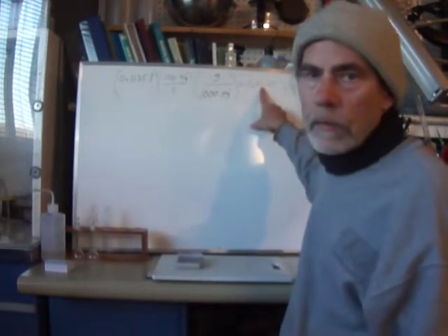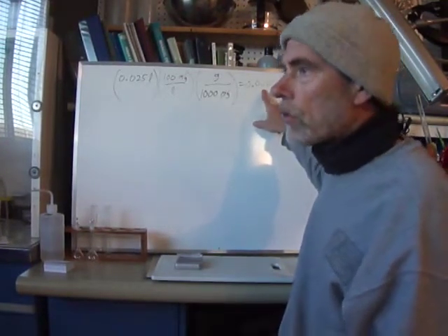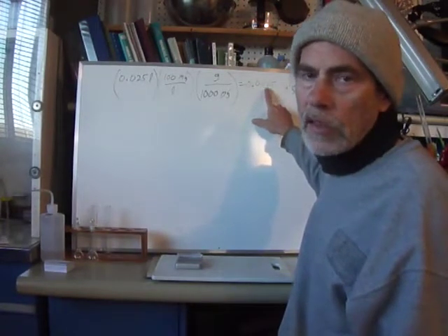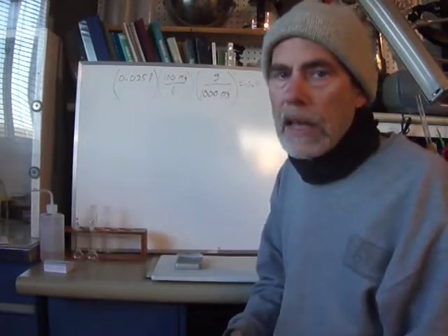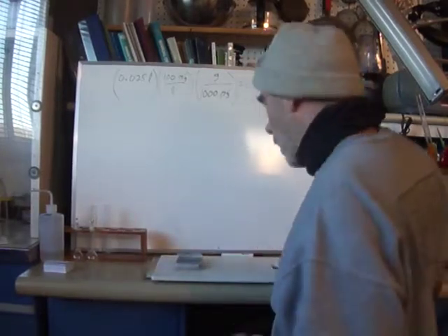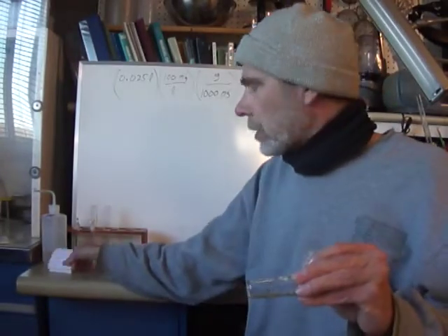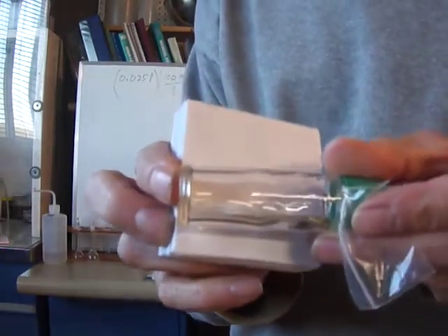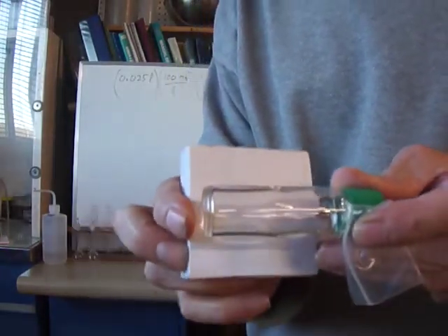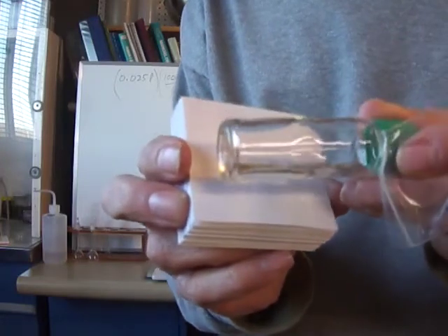My scale only goes to the hundredths place, so what I'm going to do — I've done this before — is weigh out a lot more than that. I'll weigh out to a tenth of my scale's resolution, then physically divide it up and take a tenth. I do have some placer gold from panning in various places. I'll take some of the really fine stuff, weigh up 0.025 grams, then take a tenth of that — I'll split it up physically, count the grains, and see what we end up with.